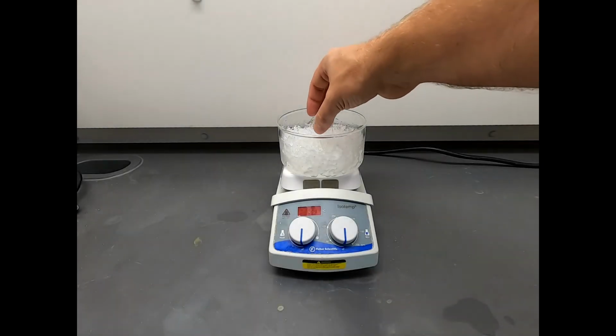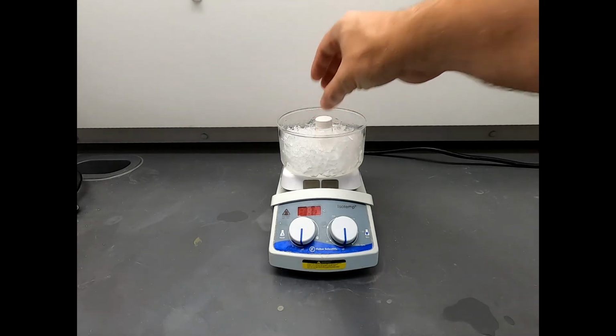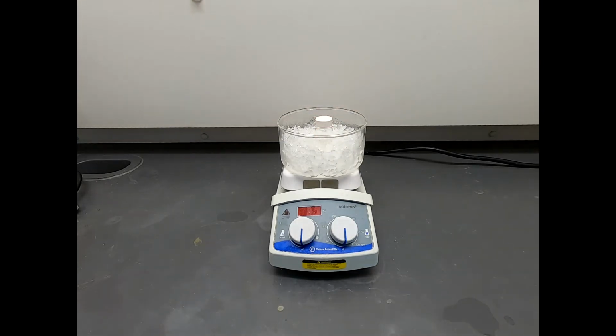Well, it's been a few minutes. Let's see what's happened. Absolutely nothing. That is not a surprise. So we're going to add the procedure calls to add some water to this. And at this point, we're probably going to see some solid.